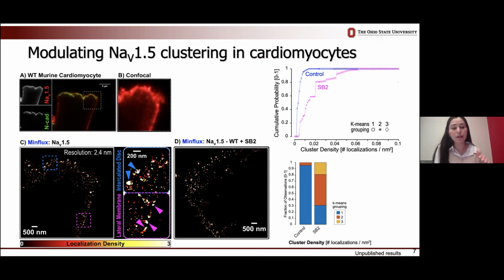Panel C is a MINFLUX image we were able to take where we were accurately able to tag sodium channels and image them with around 2.4 nanometer resolution. If we look at the zoomed in panels, we can see that we are able to see specific information about sodium channel clusters, their size, and sodium cluster density from this sample.